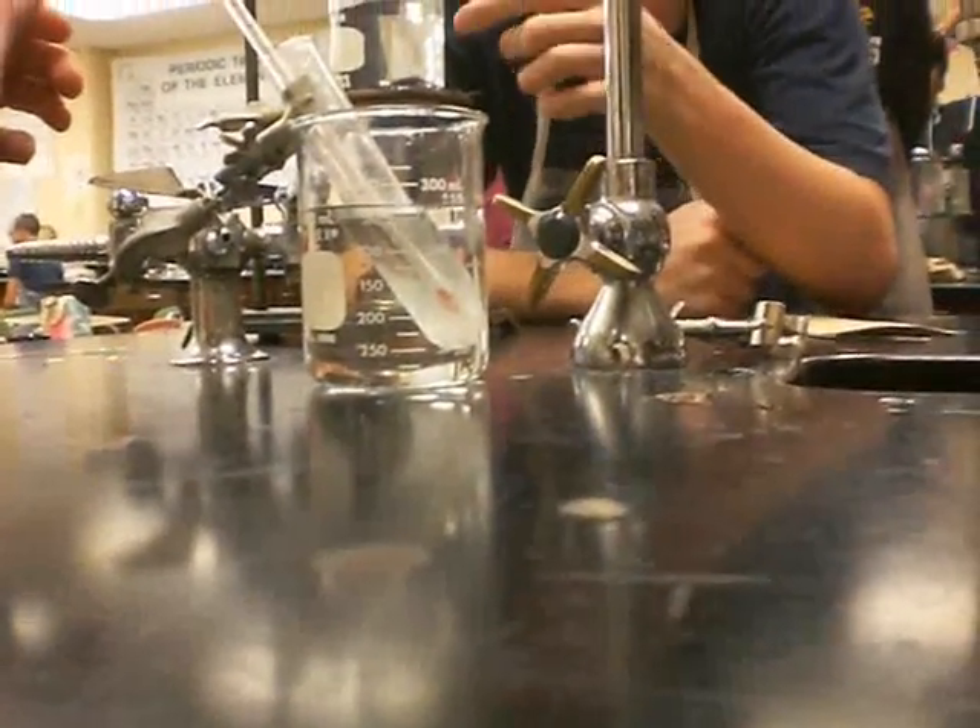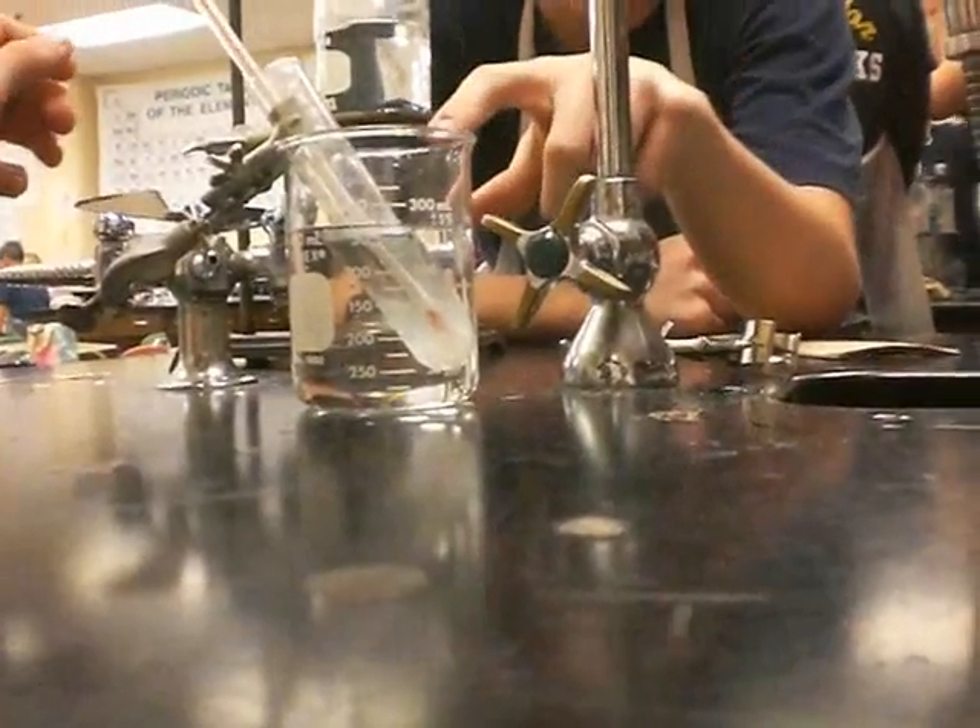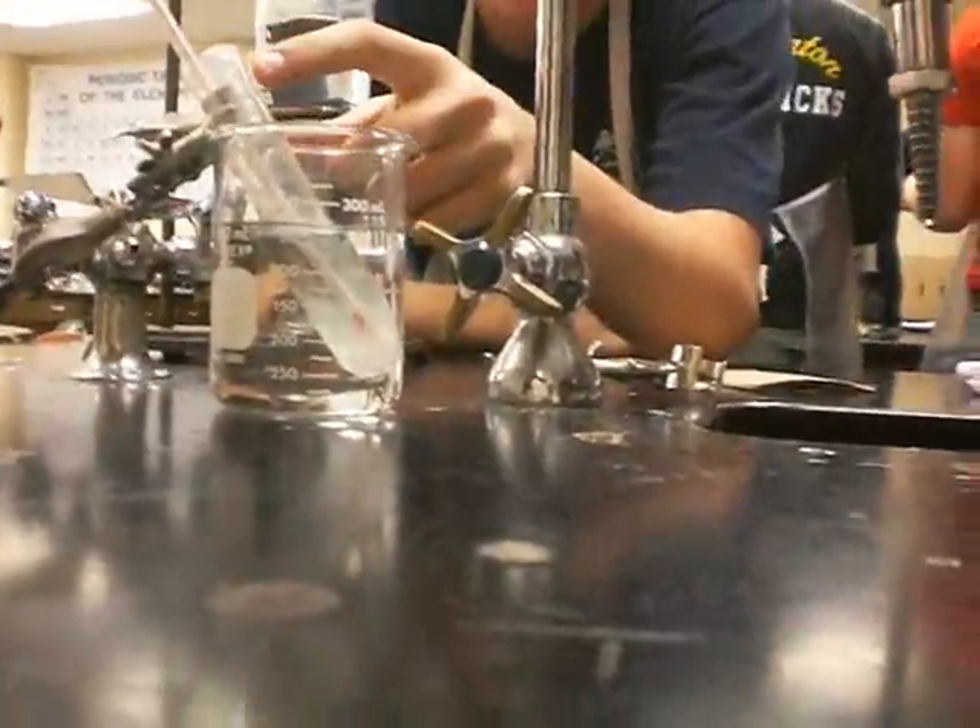Alright, we just turned off the Bunsen burner — this was at 95 degrees when we left it. When is that 75? We put it in tap water. It's been at 75, now it's at 65. The liquid in this tube is at 95 degrees Celsius.